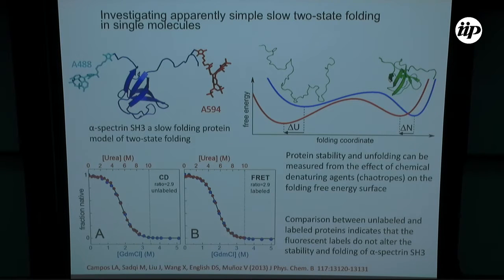The error bars, well, these are coming from single measurements. So I can give you fitting errors. The fitting errors are less than 5% on both of them. Which also, the fact that you get them to be so similar within that noise or within that uncertainty. The main problem here, the main error here doesn't come from the variation in the data. It comes more from the analysis itself, from all these baselines and all this business. So that's why I think it makes more sense to quote fitting errors in this case.